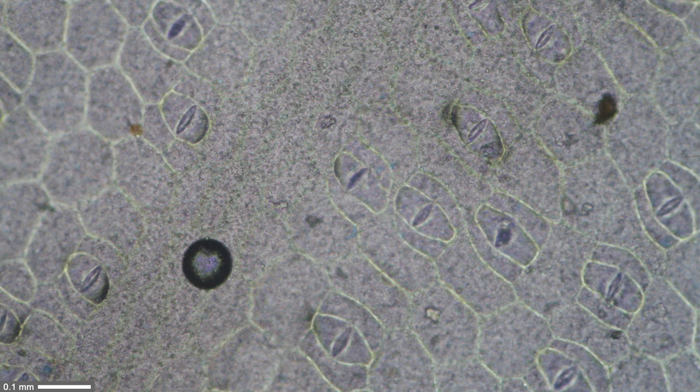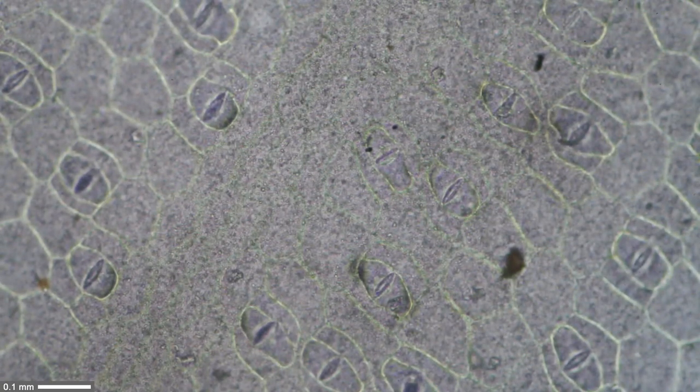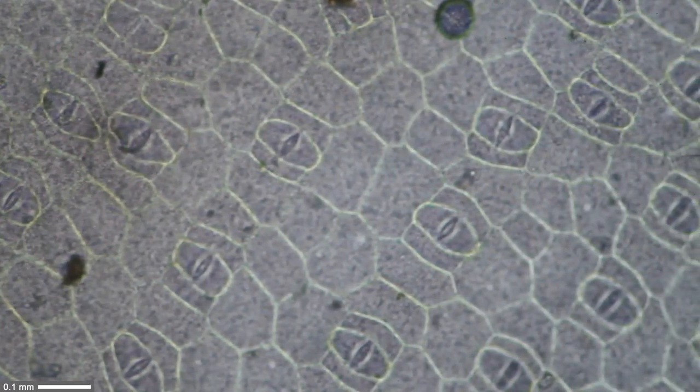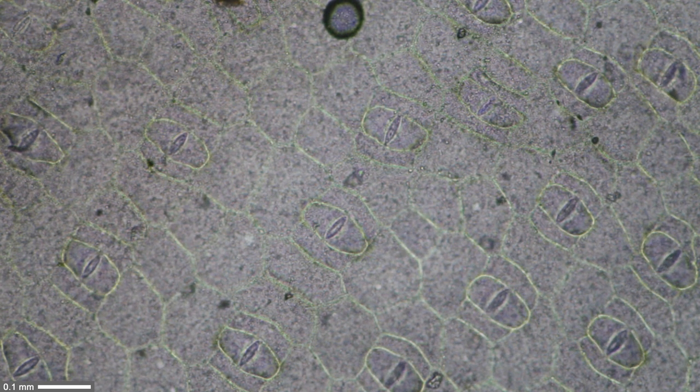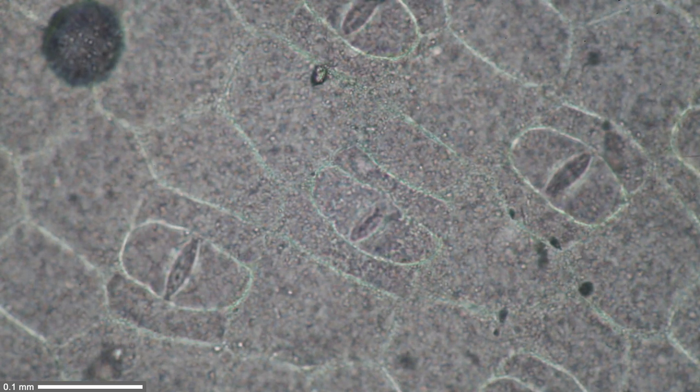At the next higher magnification we can already see the stomata quite well. I'm just scanning the slide a little bit, and if you focus back and forth using the fine focus knob, there is a certain focus where you can see the impression of the cells the best. Just to clarify — these are not actual cells, these are just the imprint of the surface of the cells of the leaf. That's why we're not seeing any chloroplasts — I'm looking at the surface texture of the leaf, which shows that the individual surface cells project outwards a little bit.